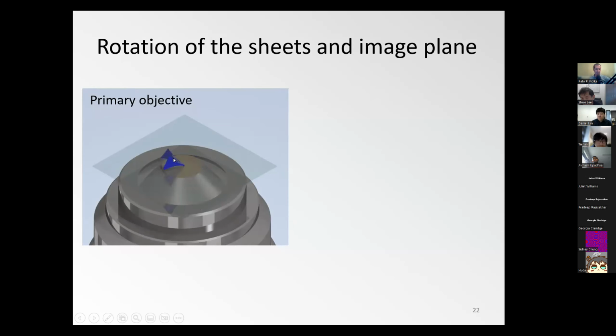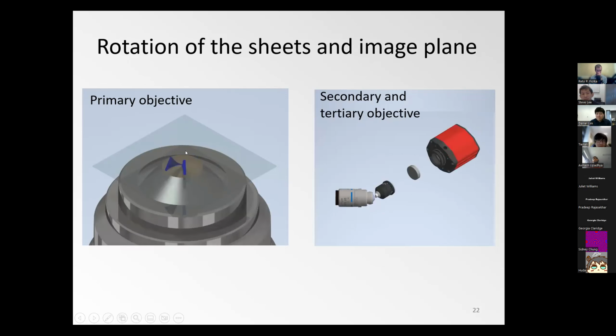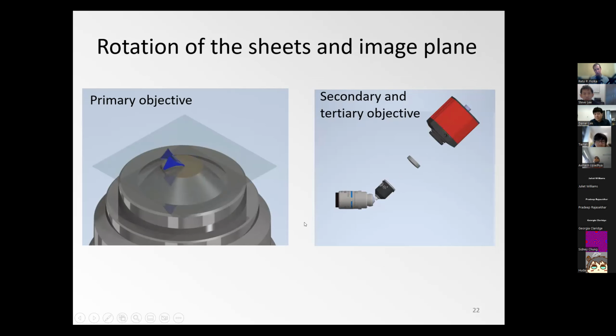There's a little caveat, because if this plane that they span or they propagate in rotates, then also the tertiary imaging arm would need to rotate, because whatever happens here is mapped over here in that remote space. And to form a sharp image, you always want to look orthogonally onto the light sheet plane. So in principle, we would need to build an apparatus that rotates this entire arm, which, yeah, I would also not want to do. This alignment needs to be rather precise, and once it's aligned, you wouldn't want to touch it. And it would probably also be prohibitively slow.